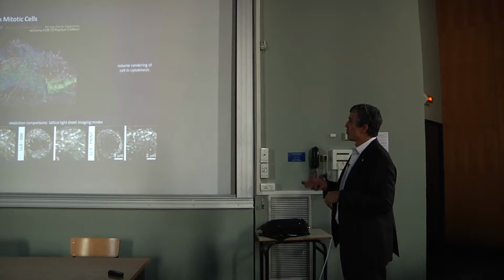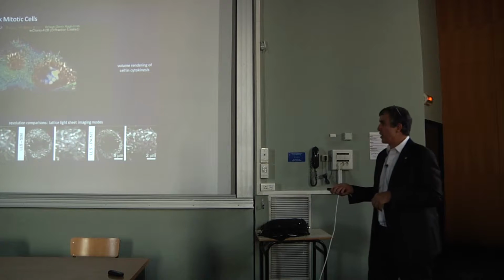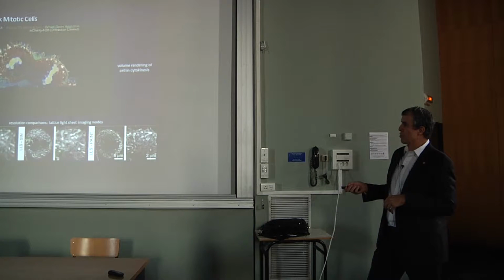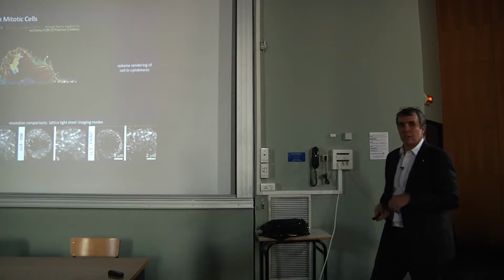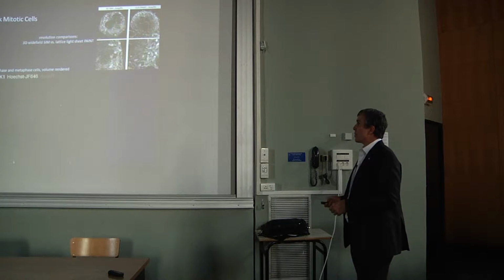And so this is two-color imaging here. We can compare that to the other modes of this light sheet microscope I'll talk about earlier, and there's the clear resolution improvement by going to localization microscopy.